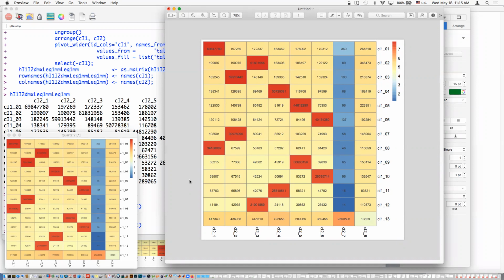First of all, you want these. Second of all, you want low density. What's possibly the lowest density dual you can make? That is where I1 alone is enough to decide, and I2 alone is enough to decide. If you put them in corresponding orders across rows and columns, the red squares will essentially be a diagonal with all other squares empty. That maximizes the ability to both detect and reject index hopping.